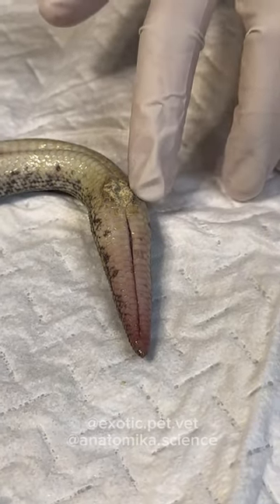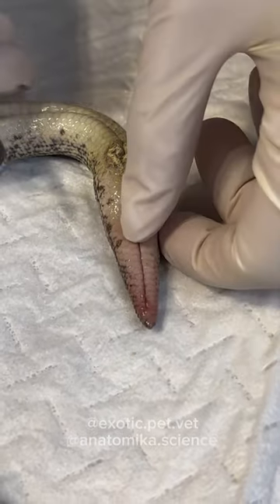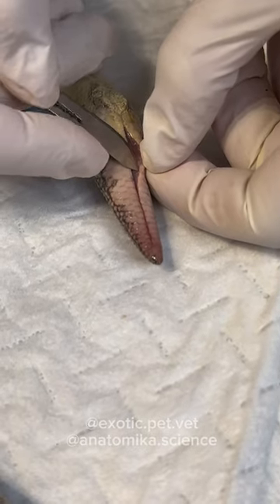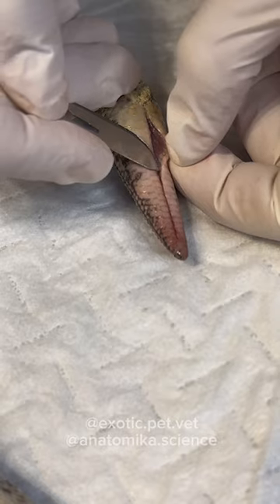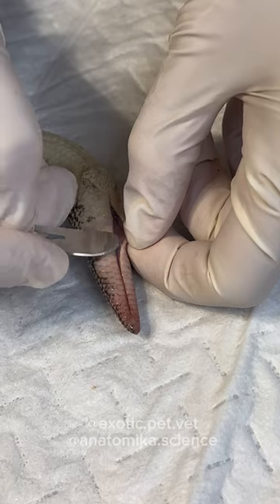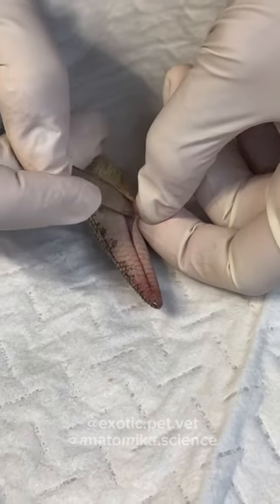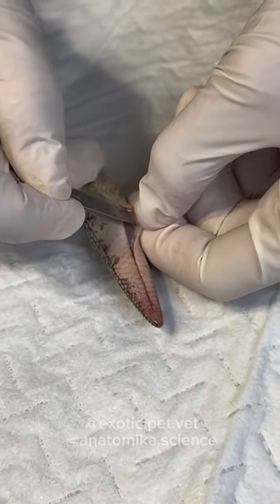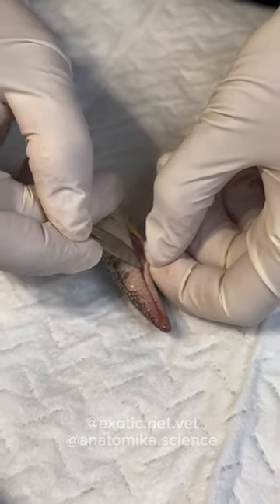Snakes have scent glands — I have no idea what they're for. I also see a dimorphic difference in the scent glands where it seems like females will have larger scent glands. I don't know why, but maybe it's because males have the hemipenes. Maybe it has something to do with reproduction and attracting the males, because the females have to attract the males — but that's just a hypothesis.